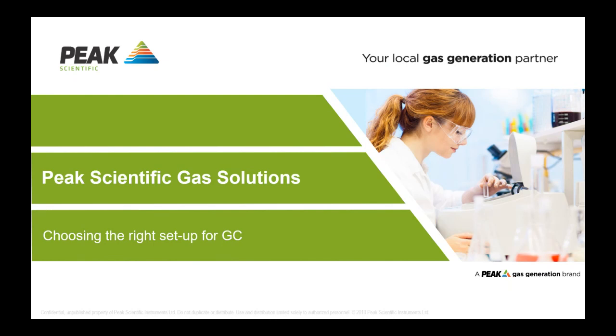Today we are going to look at choosing the right setup for your GC system. So we're going to have a look at various aspects that you may want to consider before investing in a gas generator solution for your laboratory.